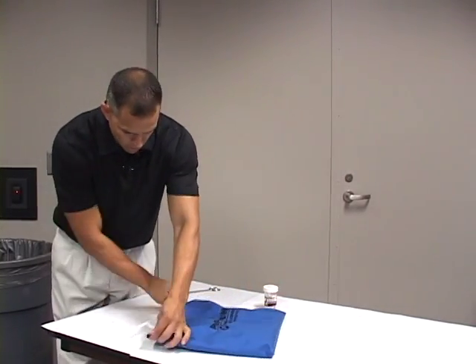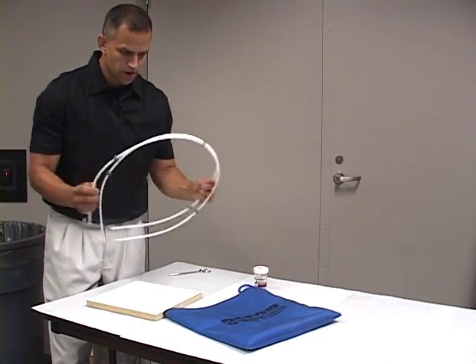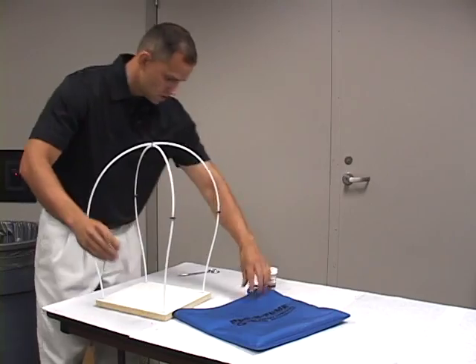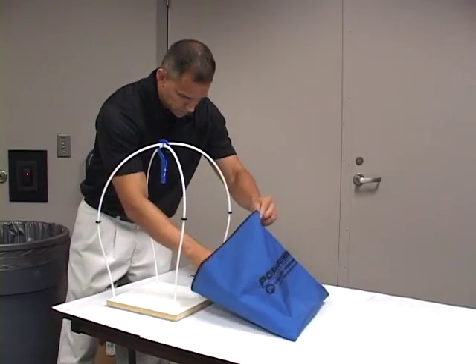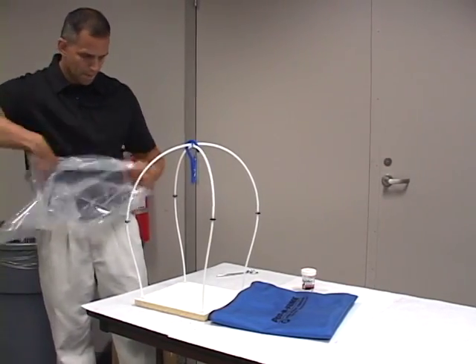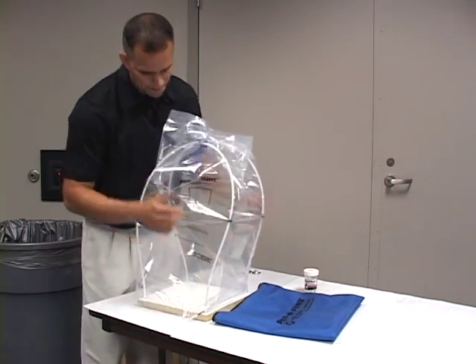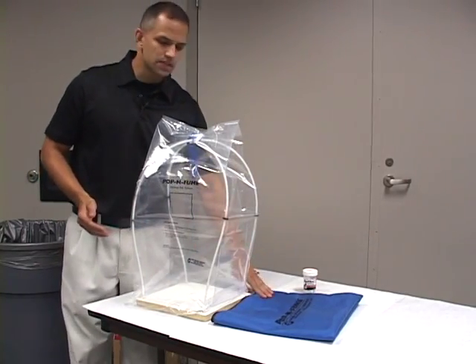So in this bag you have your base, your framework, your hook — if needed — for evidence, and you have your bag. So now you have your portable fuming chamber. It fits inside the bag. You can take it in and out of your crime scene kit.